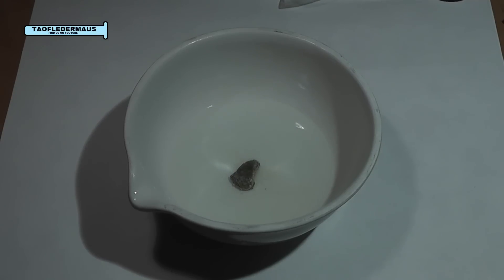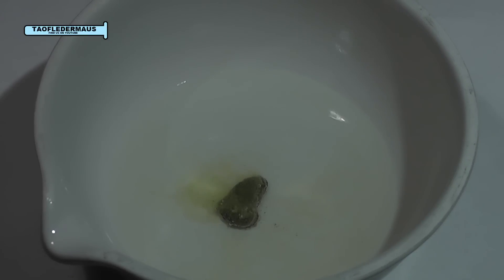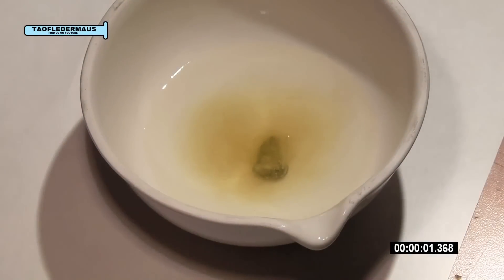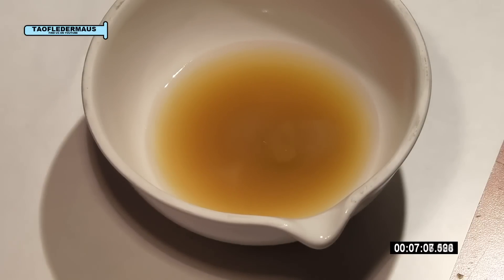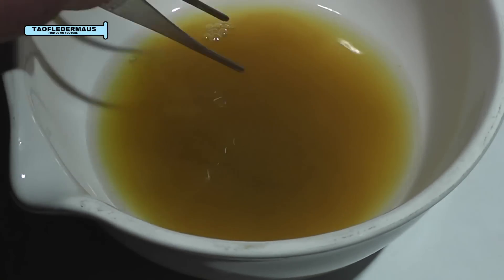I selected one of the thicker fossils to put in here. Let's watch and see what happens. Let's speed this up a little bit — the overall time it was in the acid was about 10 minutes. Now before it completely dissolves, let's see what's left of it after 10 minutes in nitric acid.